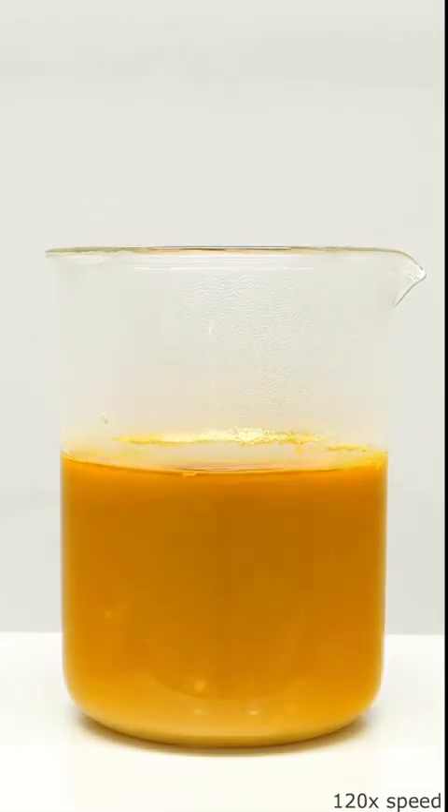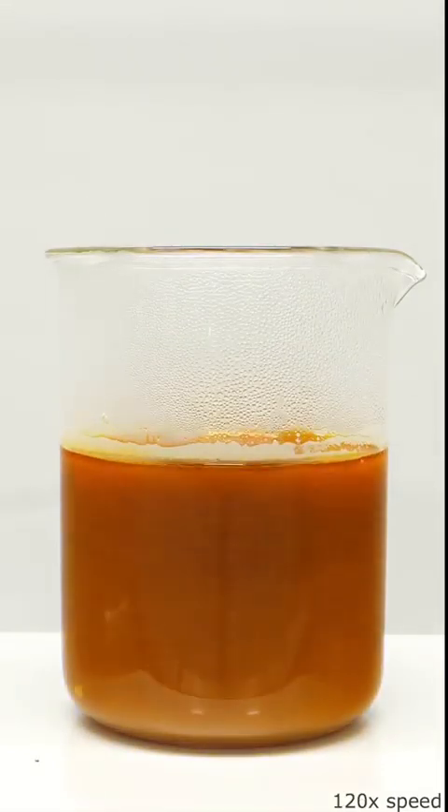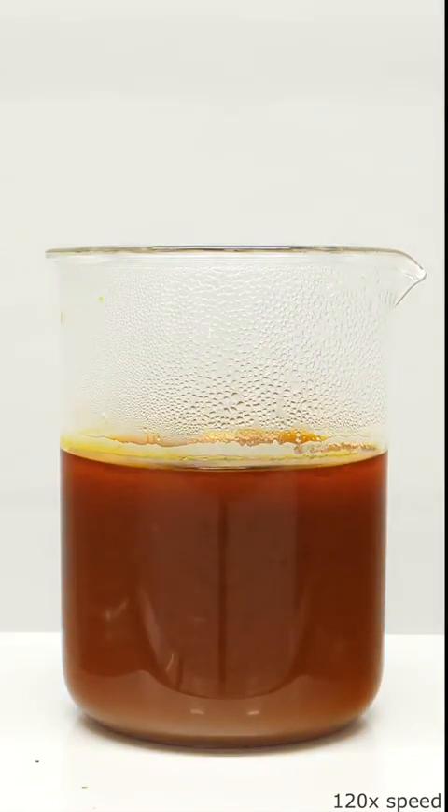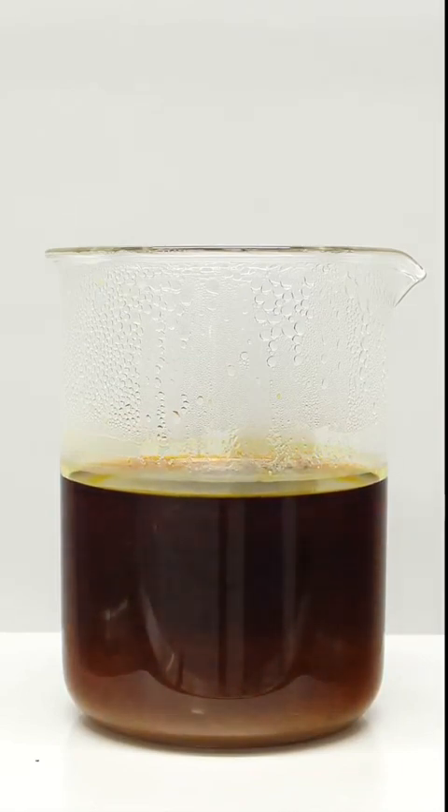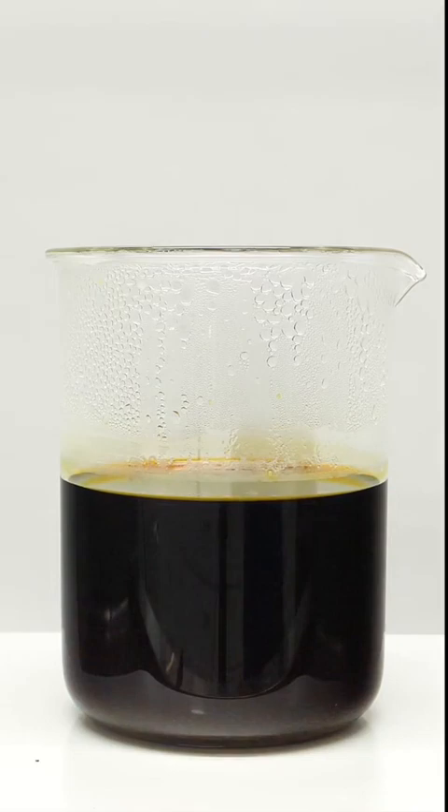This process is really slow, though, and it took about 30 minutes for most of it to react. I'm eventually left with this dark orange mixture, and when I turn off the stirring, all of the unreacted sulfur sinks to the bottom.